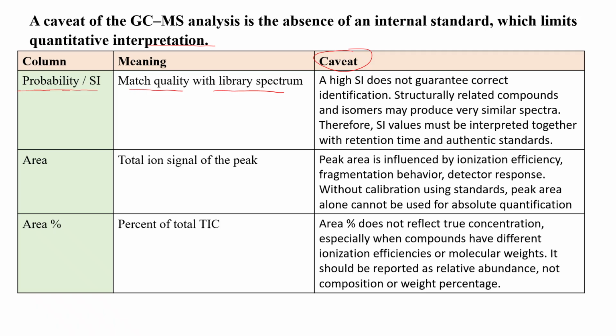The limitation is that a high similarity index does not guarantee correct identification. Structurally related compounds and isomers may also produce similar spectra. Therefore, SI values must be interpreted together with retention time and authentic standards.